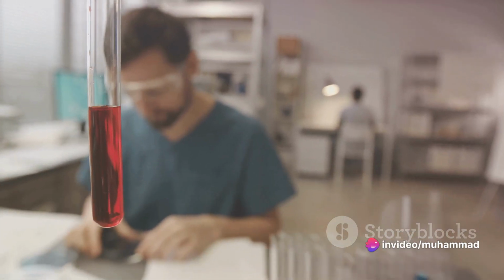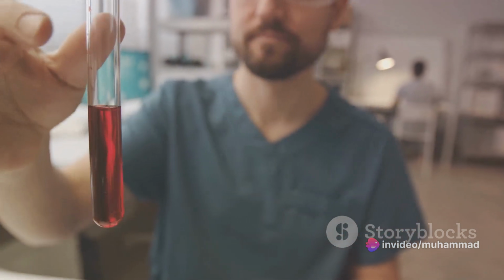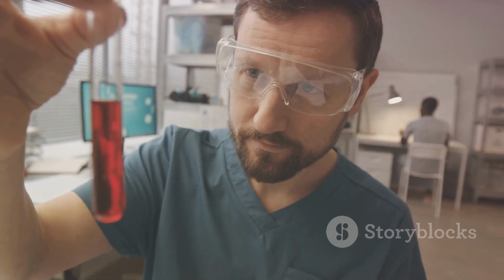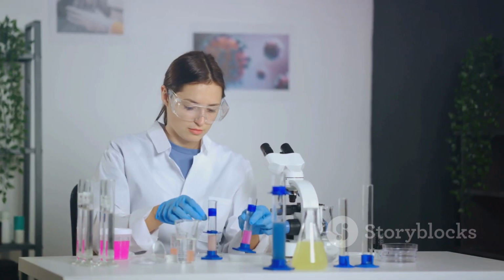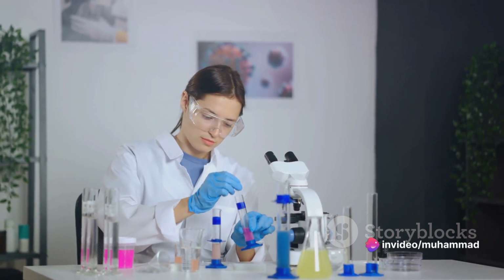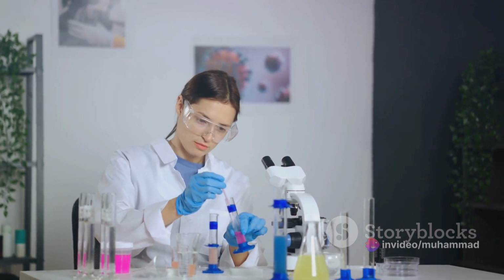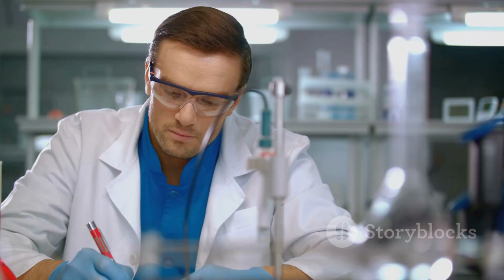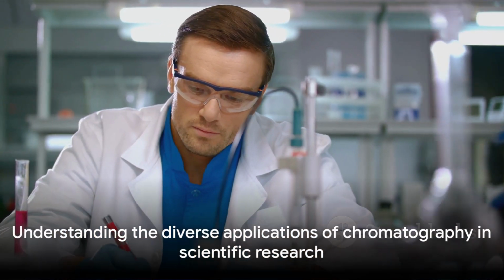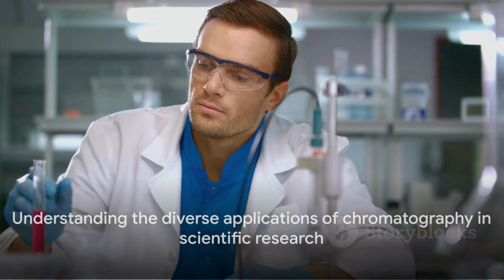Some might be better suited for certain situations than others, but they all have one common goal: to separate the components of a mixture. Whether it's to identify an unknown compound, purify a substance, or even solve a crime, chromatography is a powerful tool in the hands of scientists and researchers. And there you have it, a quick tour of the world of chromatography. Remember, each type has its own unique applications and characteristics, but all serve the same purpose: to separate the components of a mixture.